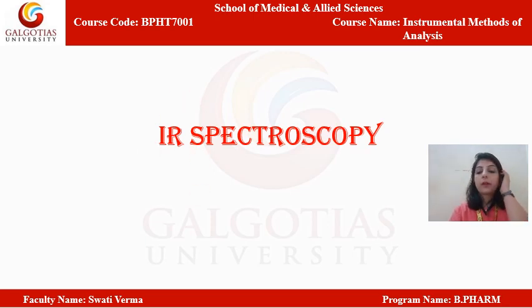Now, the most important thing is why to use IR spectroscopy. Every spectroscopic technique has a purpose for which it is used. IR spectroscopy is used for the determination of functional groups present in a particular compound. Each and every compound has a number of functional groups present in it, so for their determination we can use IR spectroscopy. Further, the type of carbon present in that compound, whether it is sp hybridized, sp2 hybridized, or sp3 hybridized, can also be determined by using IR spectroscopy.